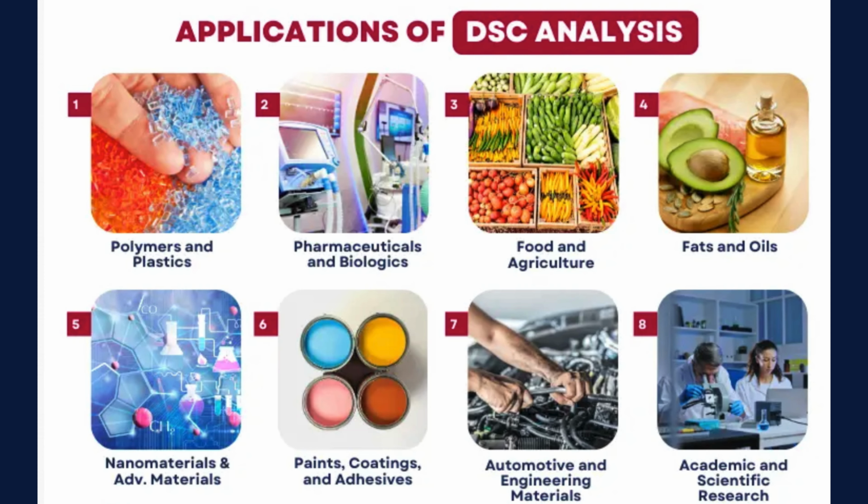In polymer science and composite engineering, DSC serves as a critical tool for material identification, quality control, process optimization, and research. The development of modulated DSC has further enhanced analytical capability by separating complex overlapping thermal events and providing more accurate measurements of thermodynamic properties. Consequently, DSC remains a cornerstone technique for understanding the structure, processing, and performance of modern polymeric and composite materials.